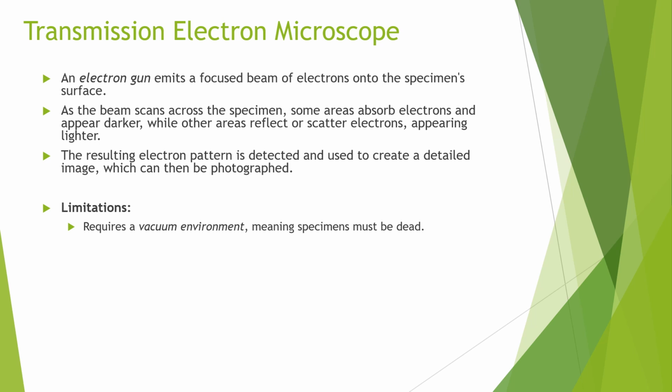Firstly, since the TEM operates in a vacuum, the specimen must be prepared as non-living. Living cells or tissues would not survive this vacuum environment, which means all TEM images are based on dead, fixed samples. This limits our ability to observe living processes directly with a TEM.